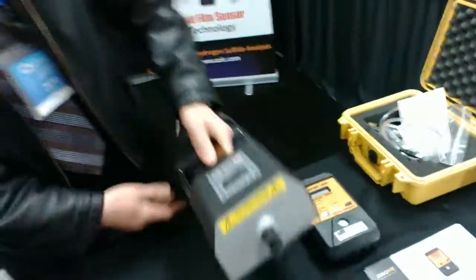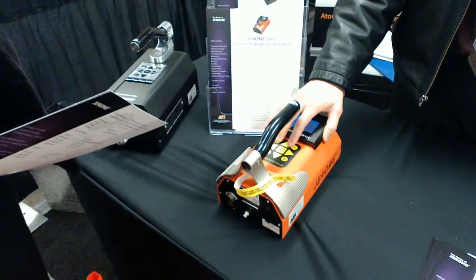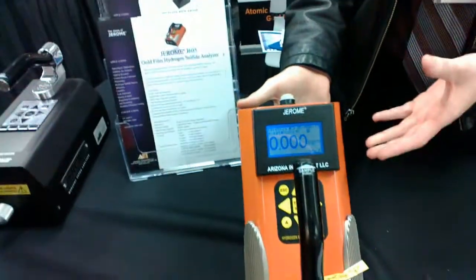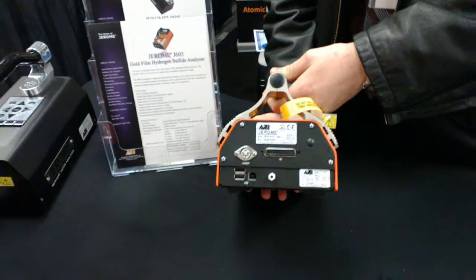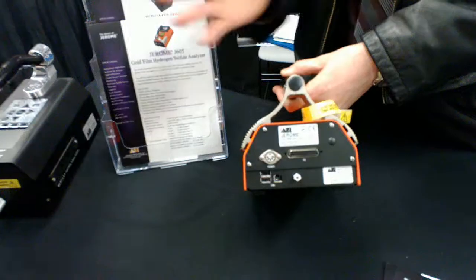Now these instruments are battery operated. This one has a 6-hour battery, and this one has a 17-hour battery. The advantage of this unit here is not only can it read much lower — everything is menu driven — but it's also got a USB flash drive in the back. So you can record your data, stick it in the thumb drive, and you're done.